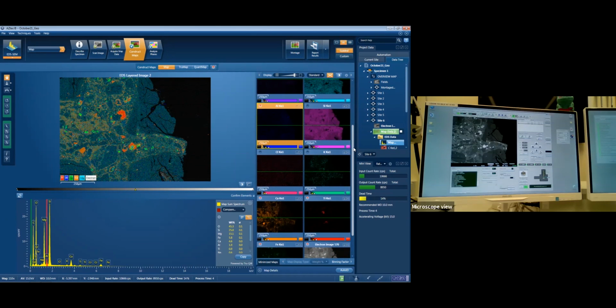Apatite, maybe? So we'll definitely give that a zap. Lots of potassium in here as well. It's nice. So now we've got this map, which is just finishing off. We can use this to pick up the different minerals we want to look at and get some spectra for. So we'll definitely do this weird high calcium orange spot.